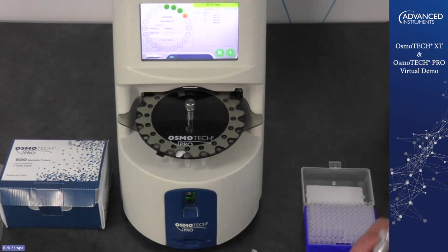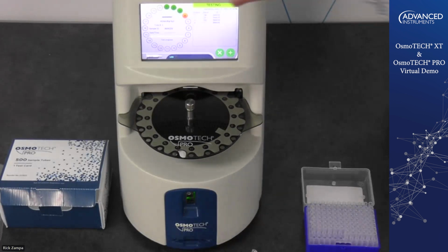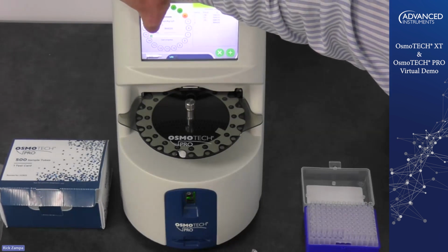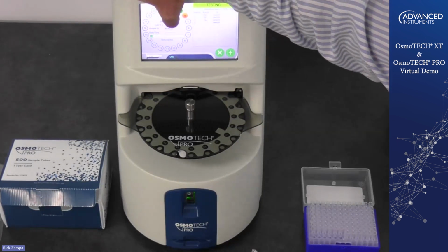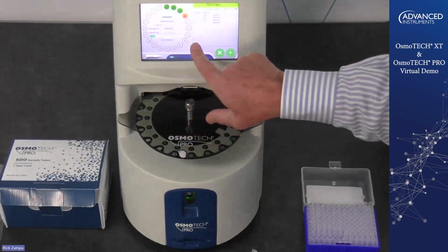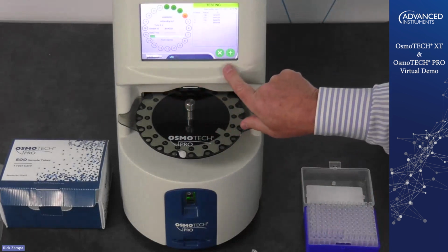I'm only going to put one sample in so we don't have to wait too long for the testing to run. You can see now it says testing at the top here. Shows that position 4 is in testing. You can see in our display here, our test result will be there. Shows us our test tube, shows our sample ID. It'll obviously give us our date and time when we're done. Again, we have our status bar there. Just a couple of other things to point out.